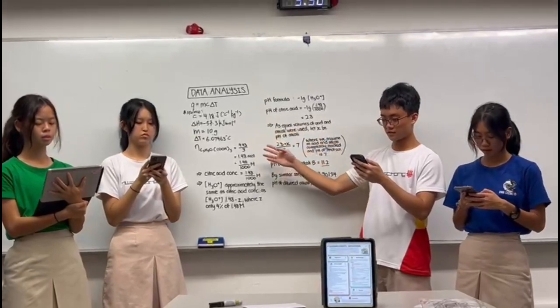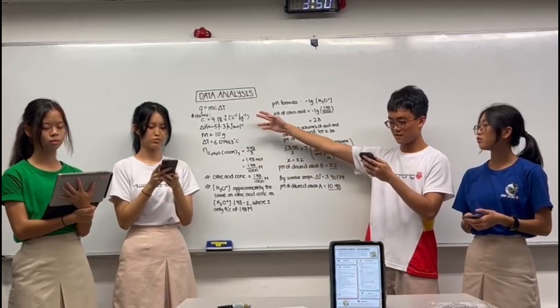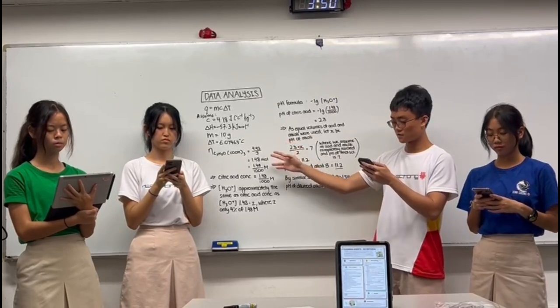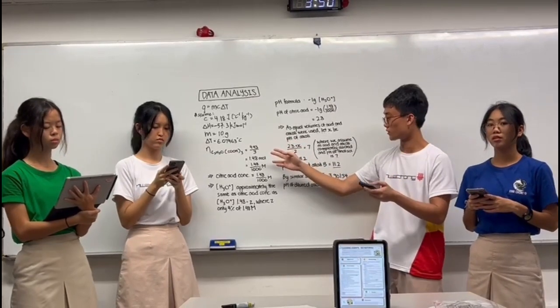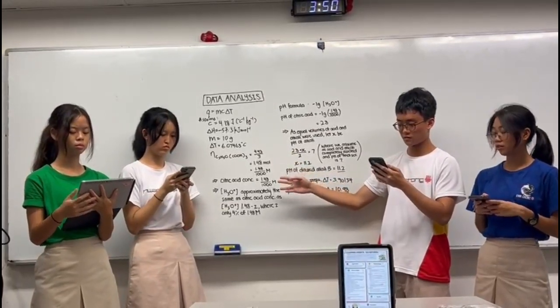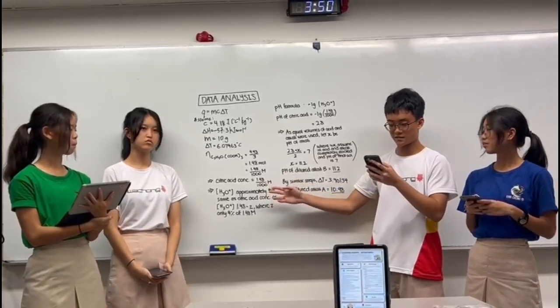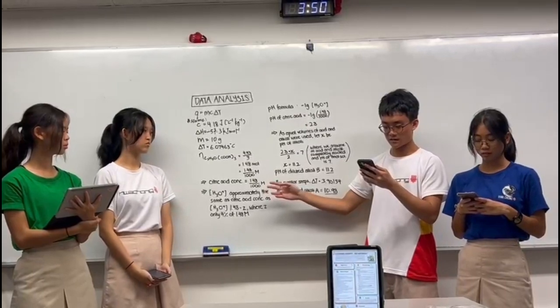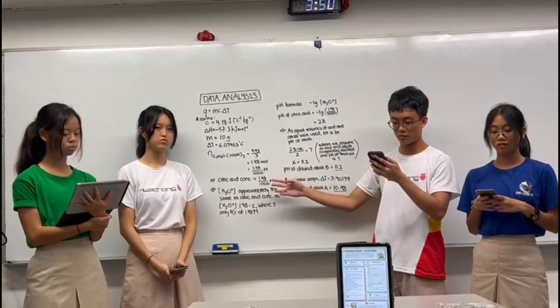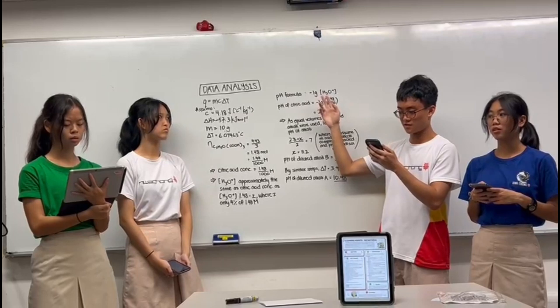Firstly, we used the microbit data to find delta T for cleaning agent B. Using the equation Q equals mc delta T, we found the heat evolved from the reaction solution. We then used the equation delta H equals negative Q over n to find the number of moles of water produced. And using the molar ratio from the chemical equation, we found the number of moles of citric acid in the cleaning agent. The concentration of hydronium ions is approximately the same as the concentration of citric acid, as the concentration of hydronium ion is only 1.48 minus z, where z is only 4% of 1.48.